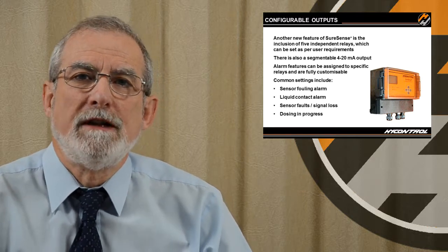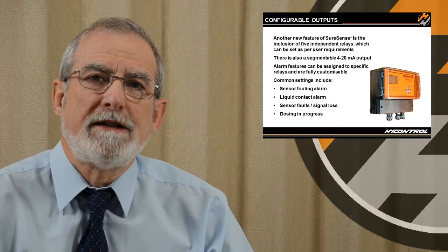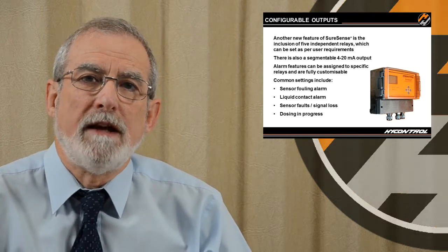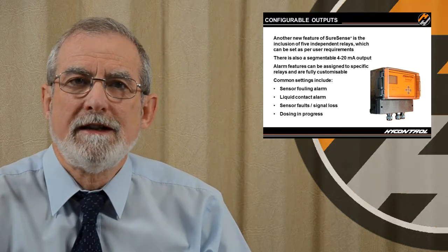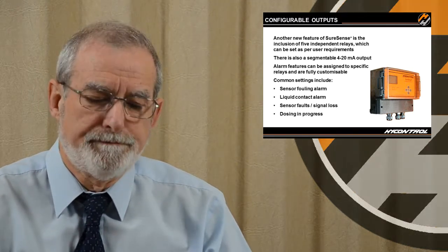While the probes are low maintenance, there's always a point at which something needs cleaning. It may not be very often, but it will occur at some point. And this is a useful feature to indicate that something needs doing in terms of cleaning the probe.